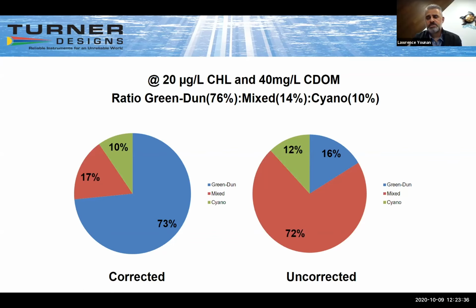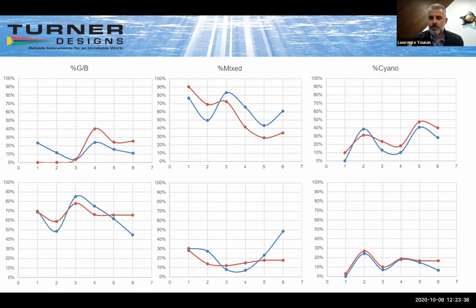And we've done several, and this is only a few examples, and this is just 2 PhytoFinds paired together, calibrated at different times. And their responses are pretty close to one another. They're not completely off.